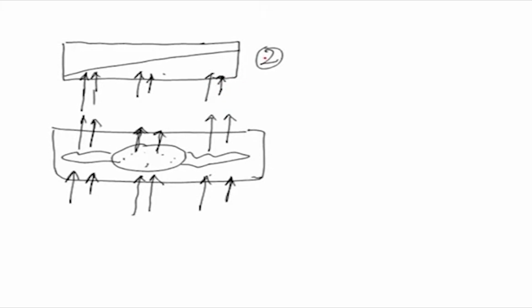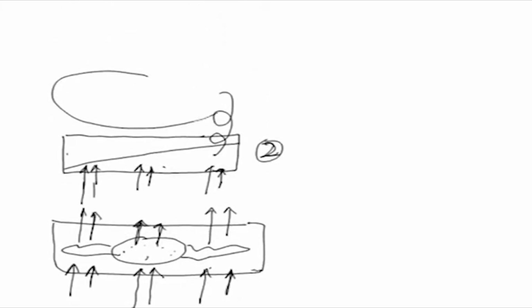These two lights will be combined by Wollaston prism number 2, and one could be combined and another could be blocked at the analyzer. Some of them which are perpendicular to the axis of the analyzer will be stopped, and the one which is parallel to the analyzer, I will explain it further, is polarized at 135 degrees.